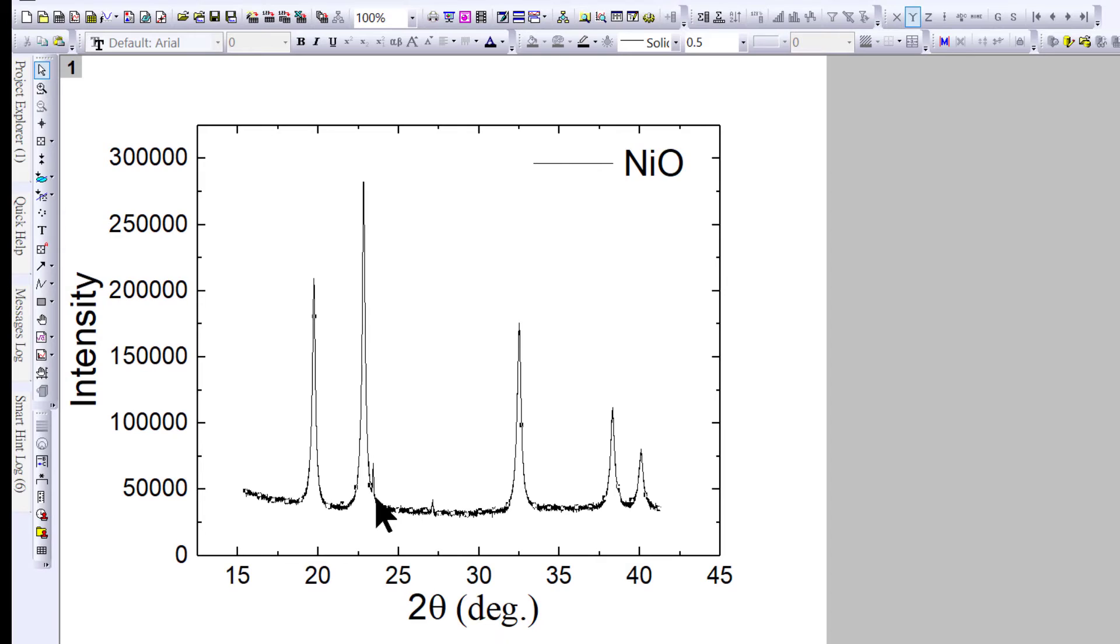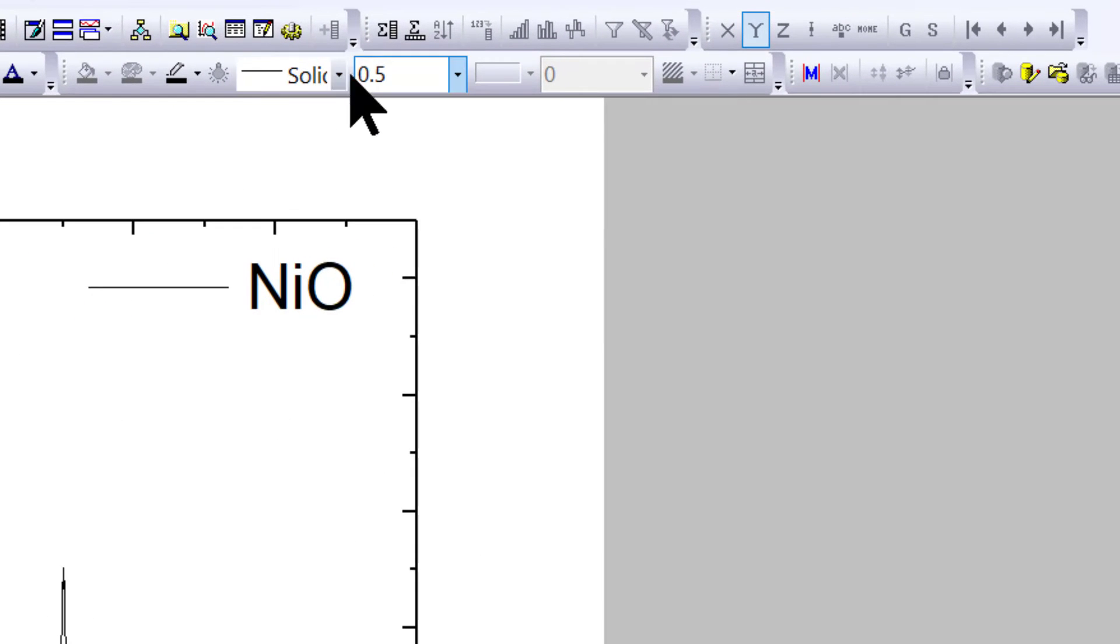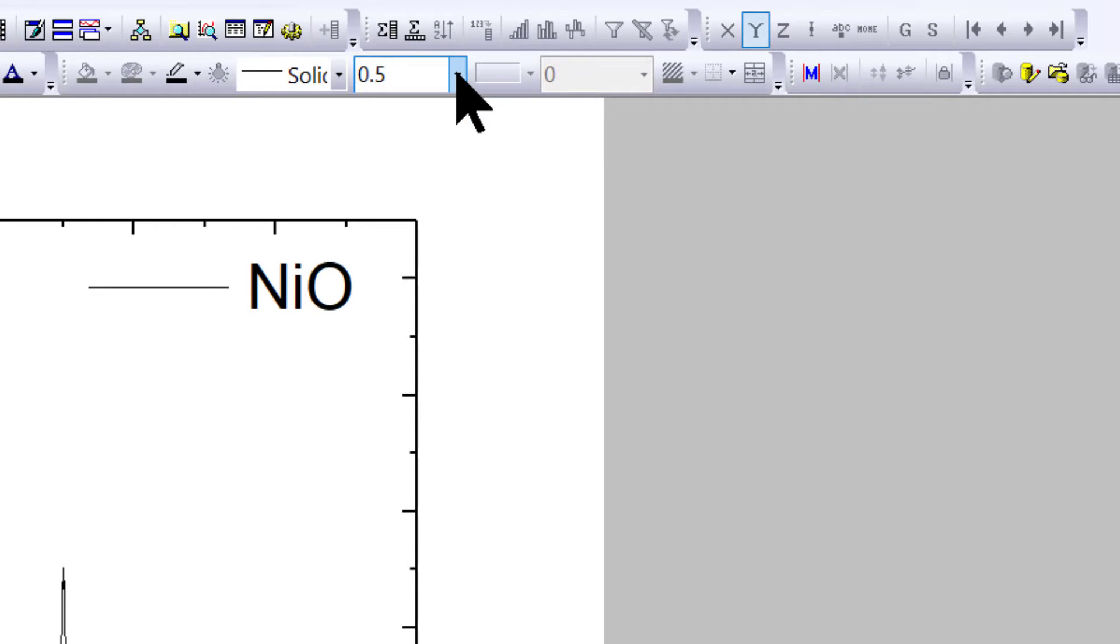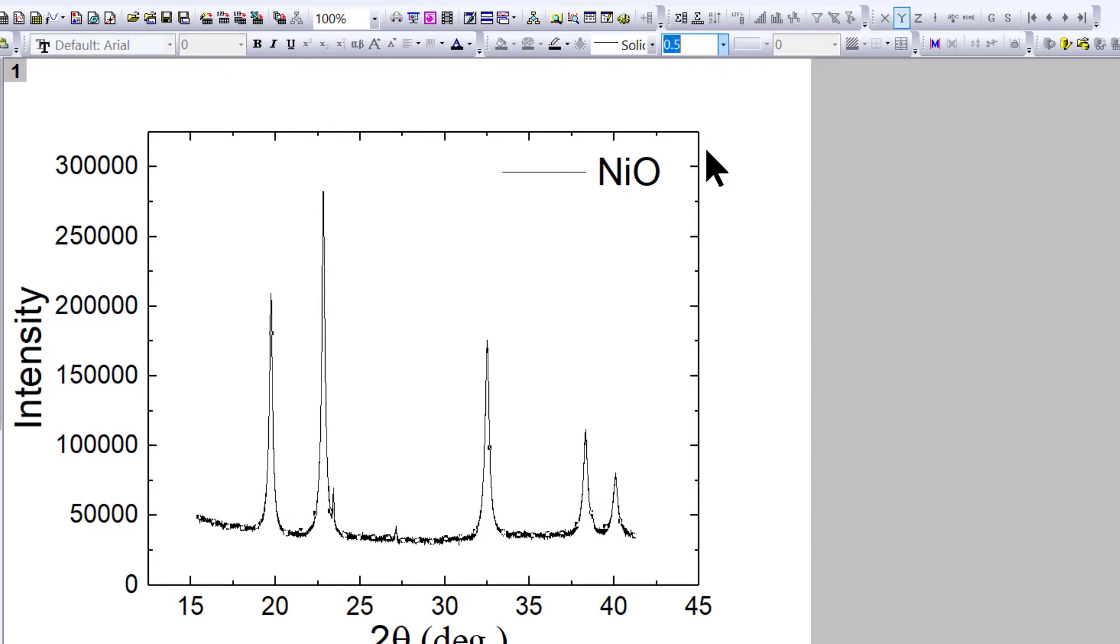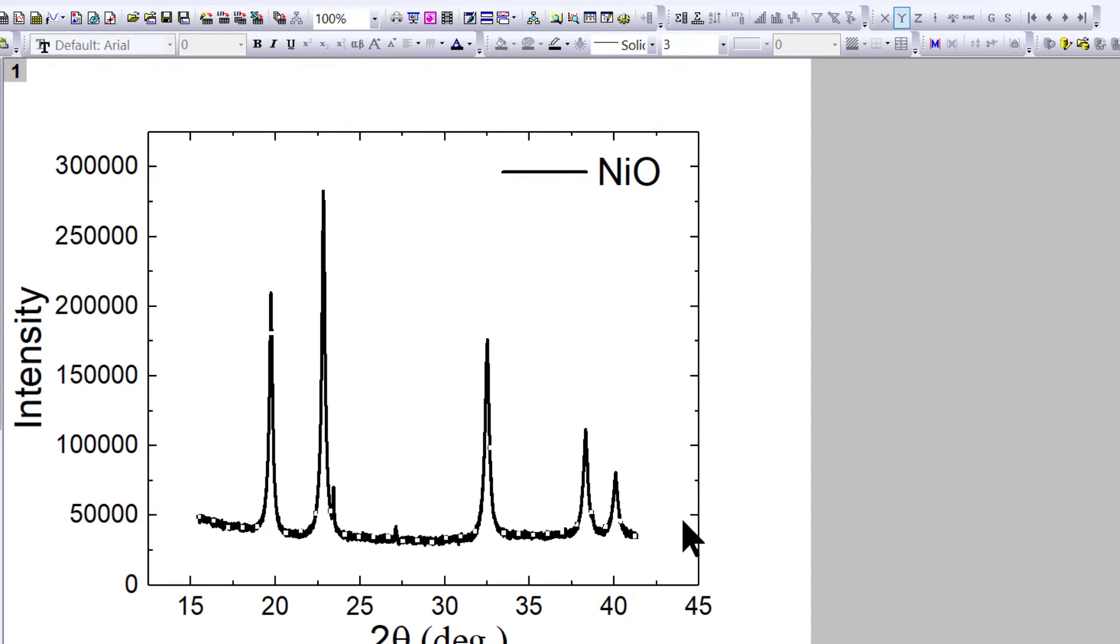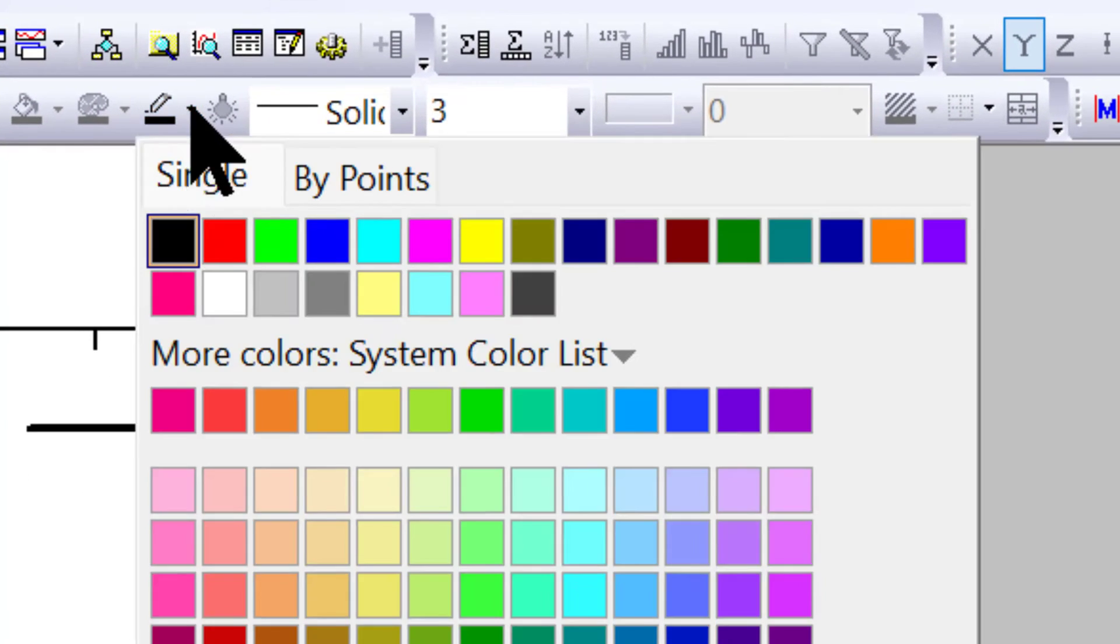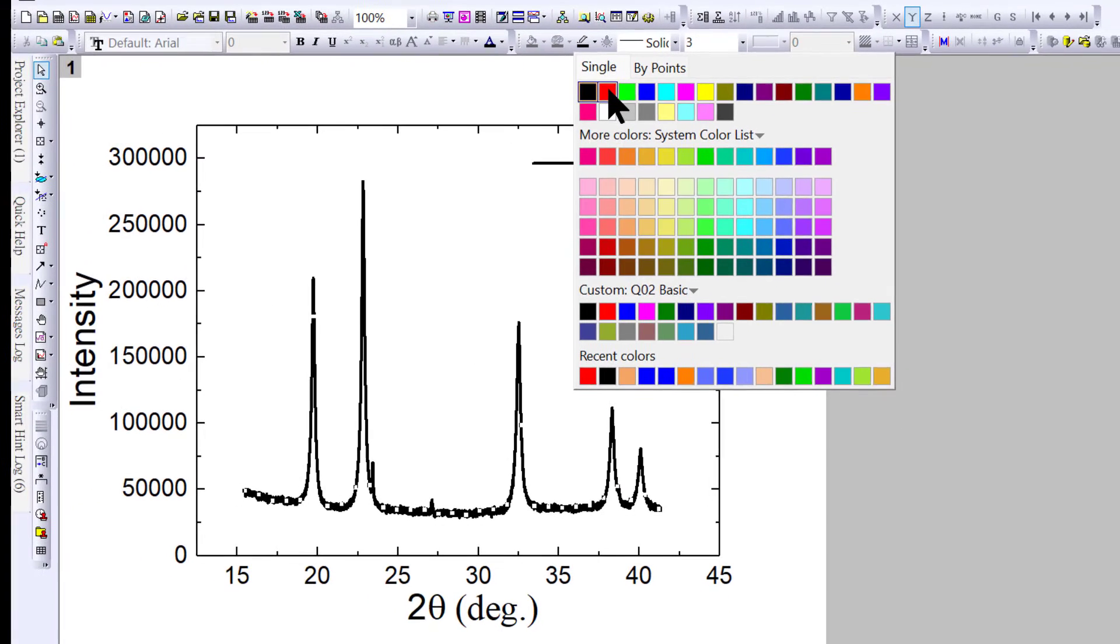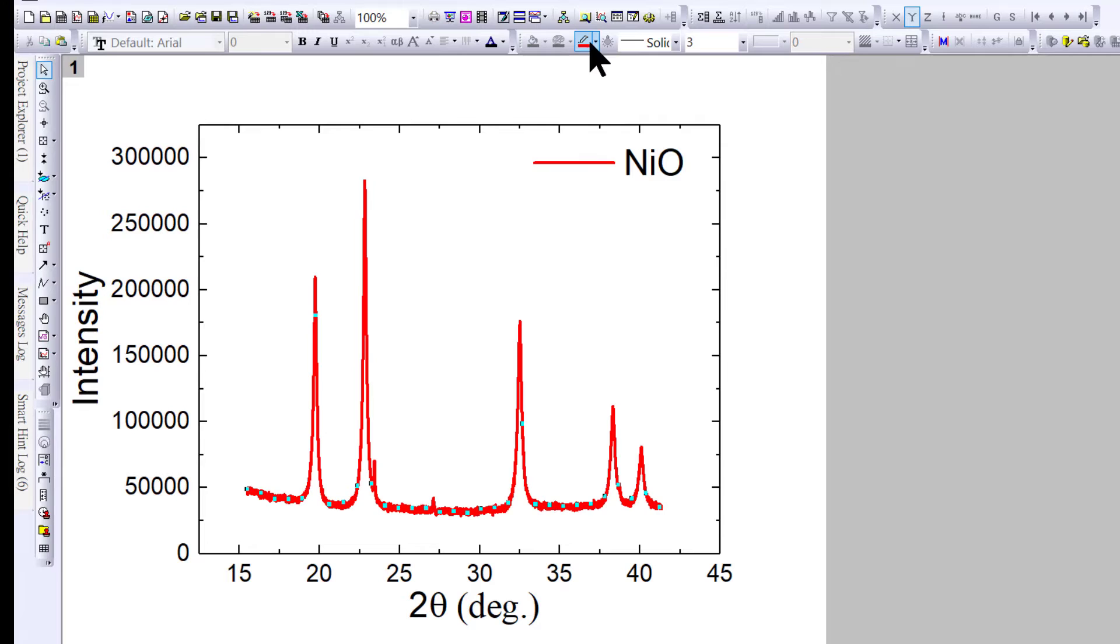If you want a thicker line—right now it's a solid line with thickness 0.5—I would like a thickness of 3, so it will be thicker. If I don't want black, I can choose red color here, so the line becomes red.